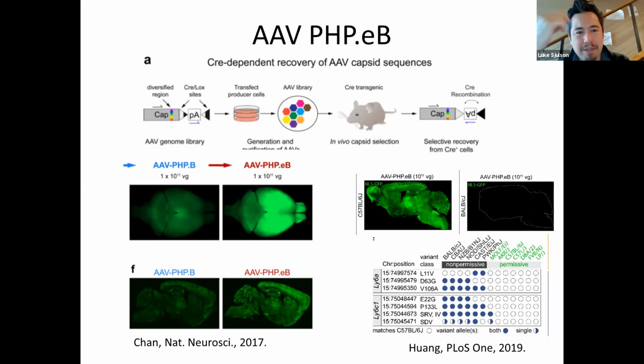I don't know if you're going to talk about that at all, but you can do things like qPCR titering, where you're just using qPCR to count the number of viral genomes, like the number of DNA molecules in the tube. And then you can do what's called functional titering, where you actually, for example, infect some sort of cells and then keep diluting it and find out what's the smallest dilution you can use that actually infects the cells. So almost nobody does functional titering. You do qPCR titering. But the thing is, if you boil a tube of virus and kill it, its qPCR titer doesn't change. So it just tells you how many virus particles are in there. It doesn't tell you whether they're functional or not. So in one case you have particles, in the other case you actually have infectious.